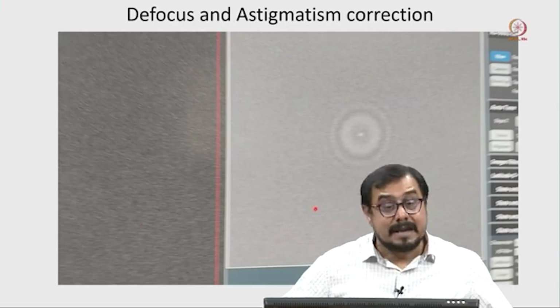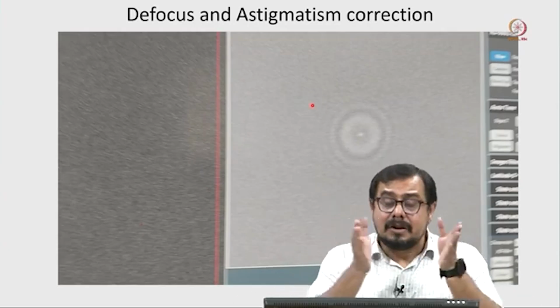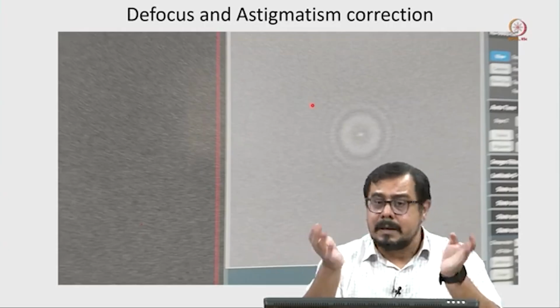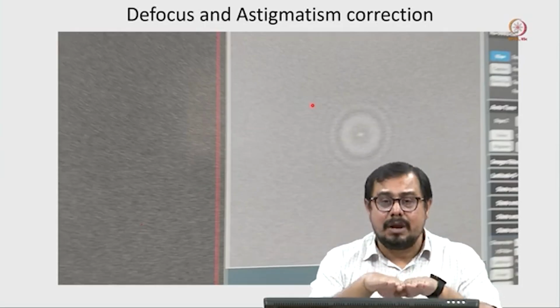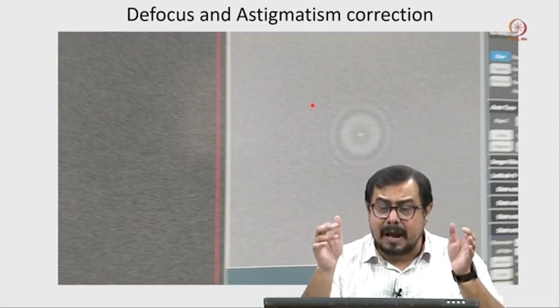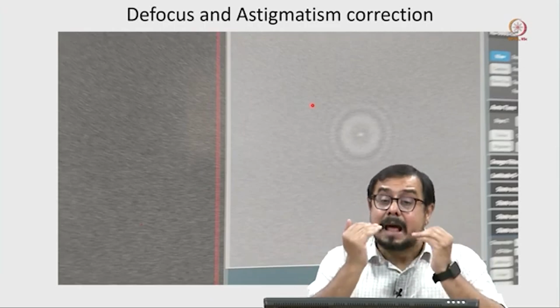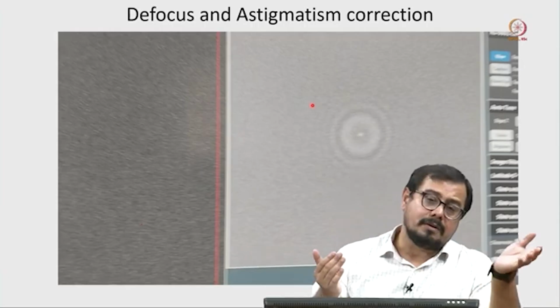Now, I am coming to the next one, which is very important: what kind of fringe we can see when we have different defocus values. I told you that at zero defocus value you cannot see your image clearly. Zero defocus means it is the actual focus, but at actual focus our eye cannot see it clearly, because there will be no white fringe or black fringe.